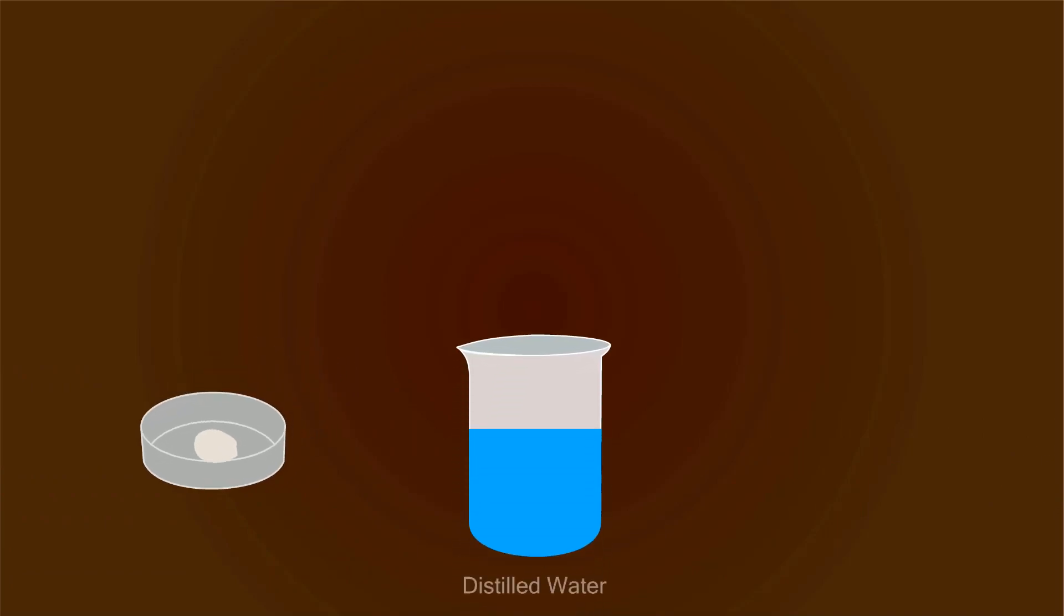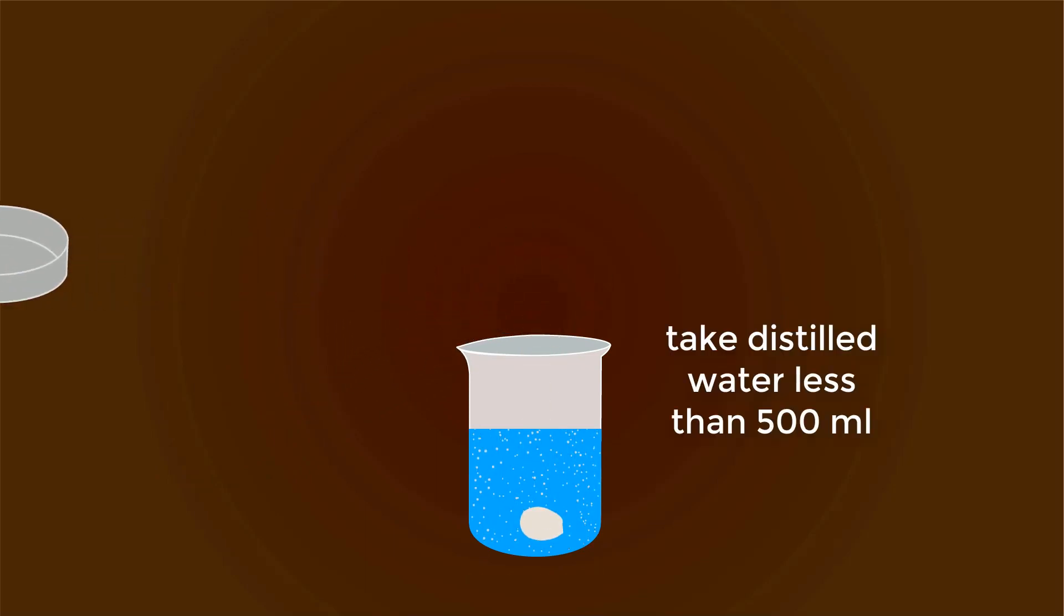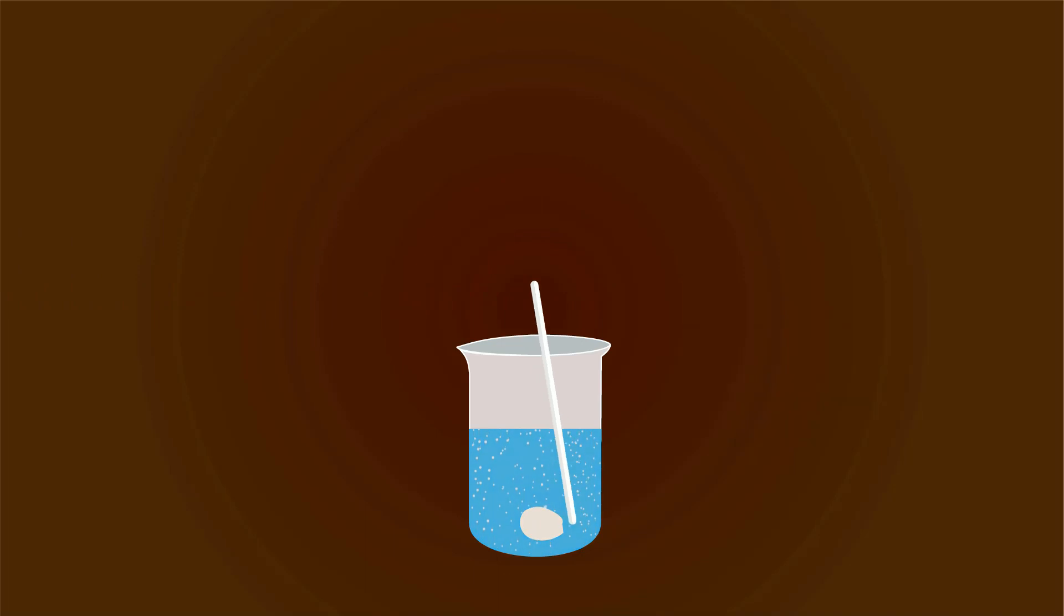Now take water in a beaker up to 500 milliliters and you can start adding sodium thiosulfate. Don't forget to mix it well to make a homogeneous mixture.